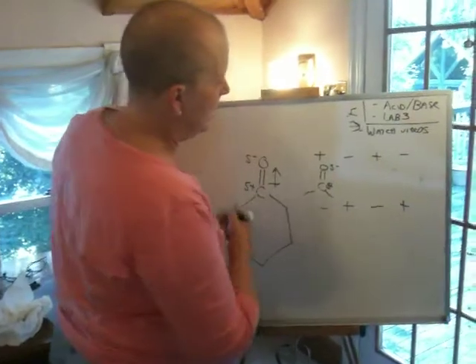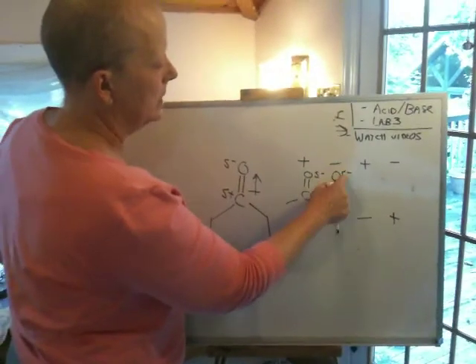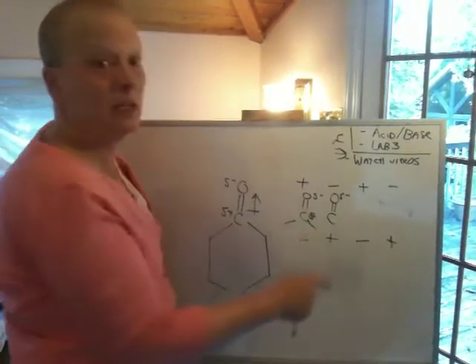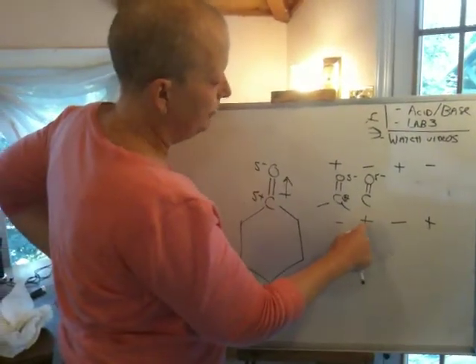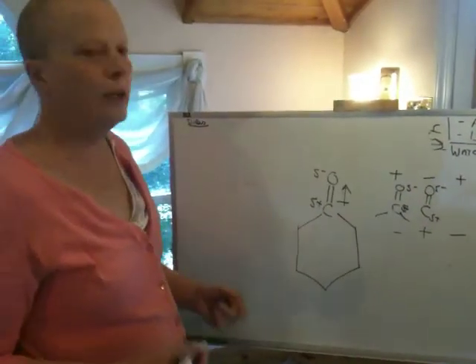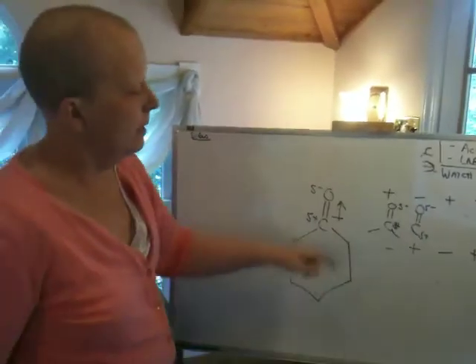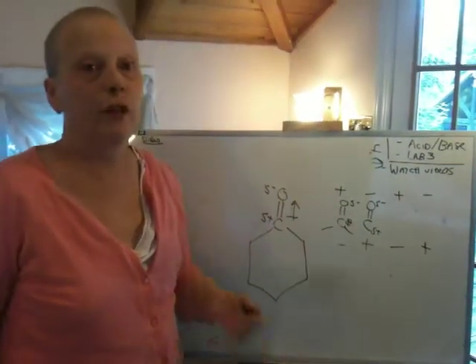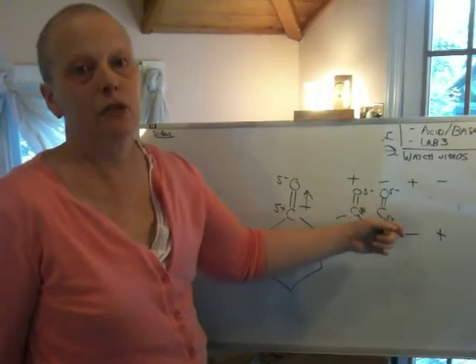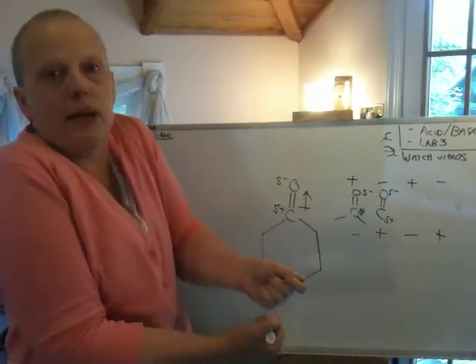Okay, so then imagine the same group at another point in time where the delta minus is pointing toward the negative end of the field because it's oscillating at a particular frequency, at 1700 reciprocal centimeters. And the positive end is pointing toward the positive end of the carbonyl. Okay, what would it do? Now, some students would tell me the carbonyl will flip over. Now, remember, the molecules are tumbling, but this oscillation is very rapid compared to the translation of the molecule. So you can think of it as not having time to turn over, okay? If it doesn't have time to turn over, what is that bond going to do? That bond's going to compress more, okay?